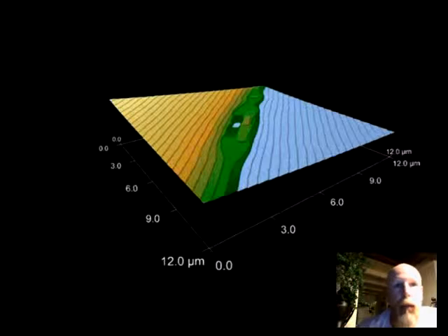An E-box includes all the electronics required to drive the AFM stage, the Z-stepper motor, the piezo scanner, plus functions to access the electronic boards, imaging monitors, and microscope, and software such as LabVIEW. And you probably need a vibration cabinet as well to operate these things.